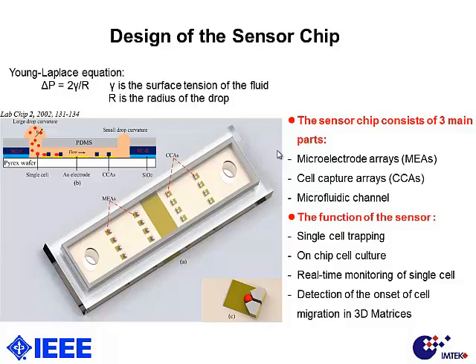When we place 2 different curvatures of solution at the inlet and the outlet, the different pressure here induces the flow.